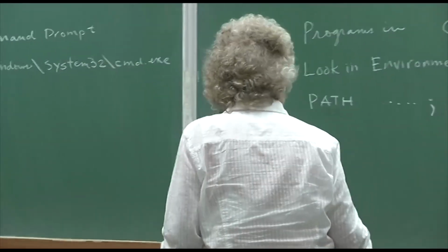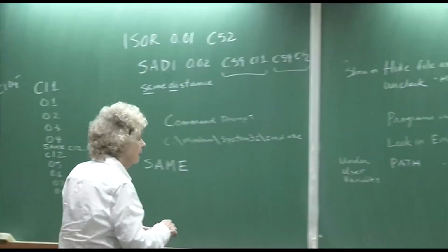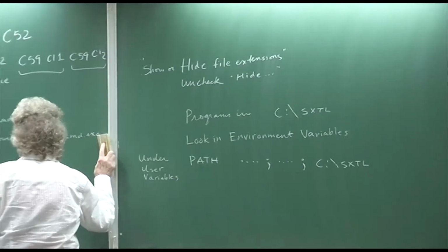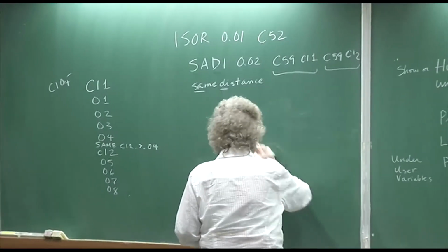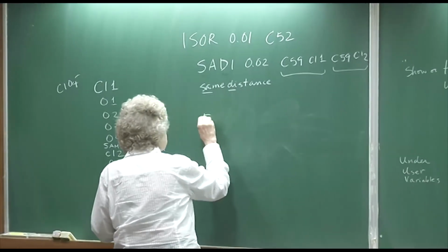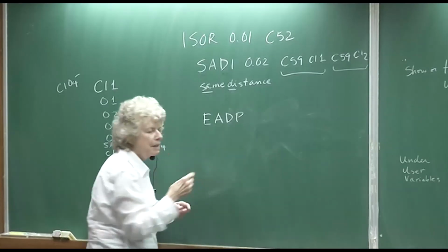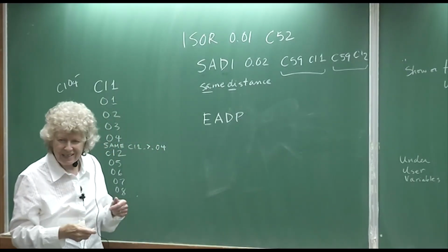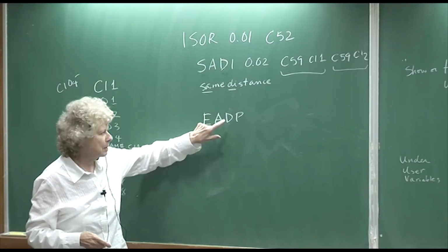So EADP, let me go to that one. Another way to manage things. ADP stands for atomic displacement parameters. So E stands for equal atomic displacement parameters.